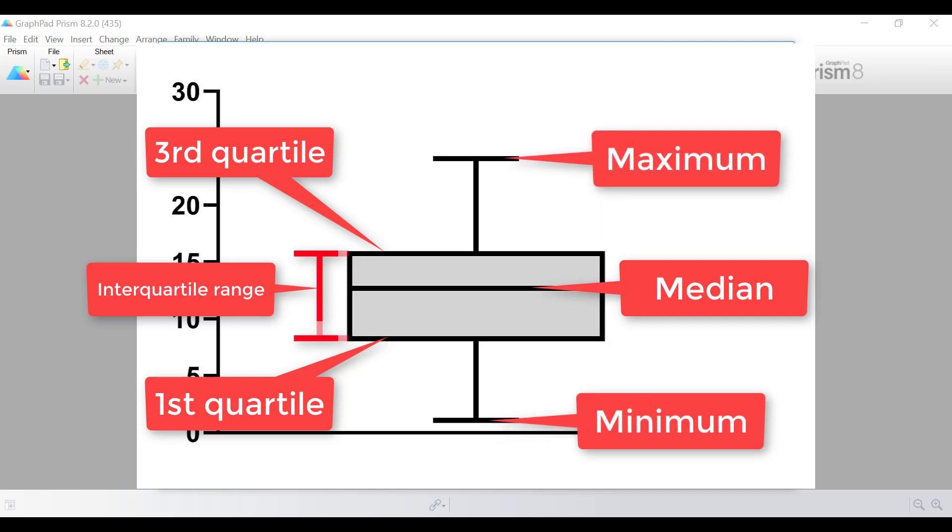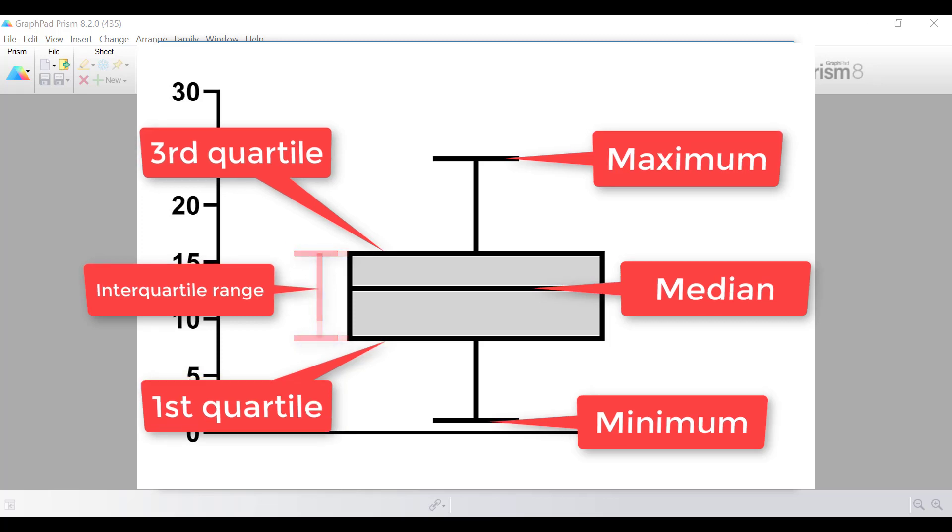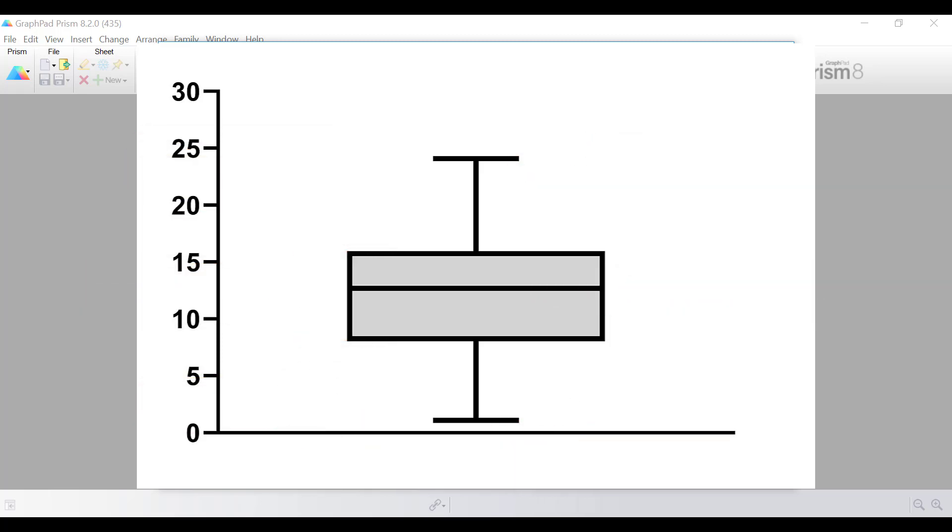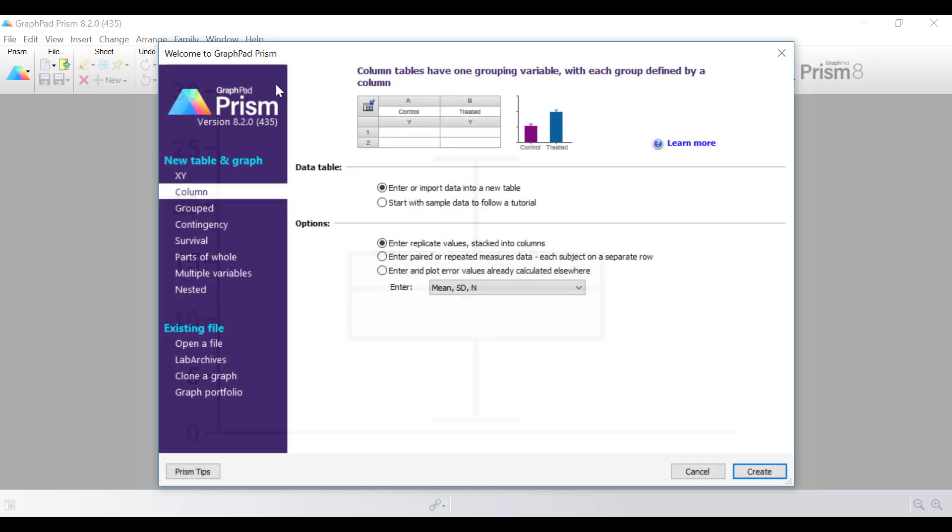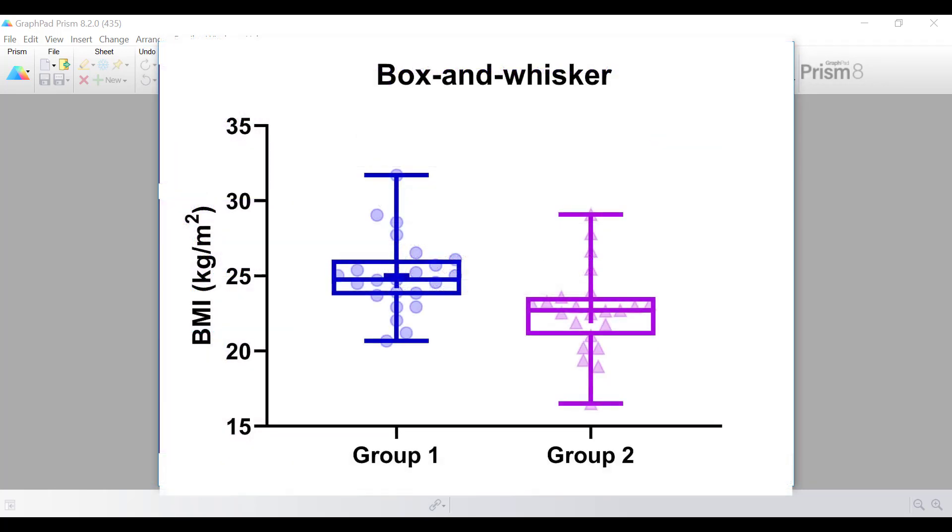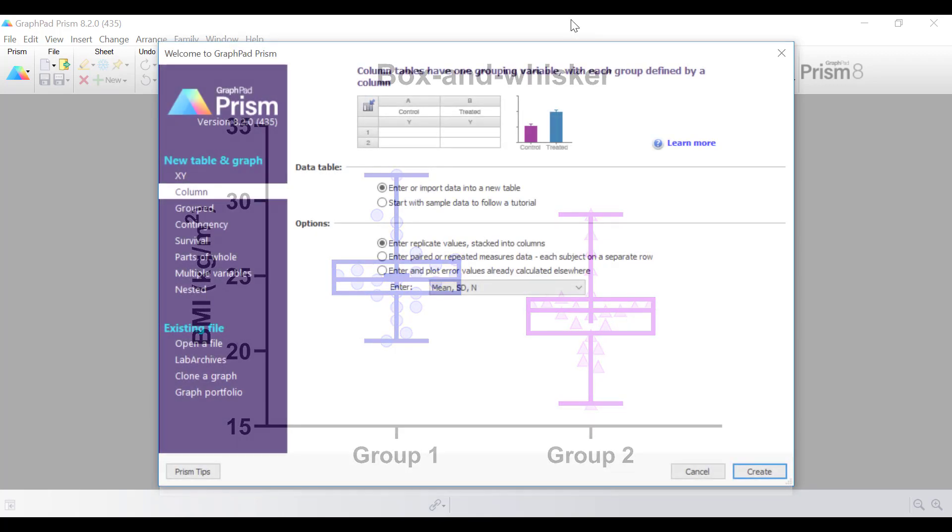By looking at these points of interest on the box and whisker plots, it can tell you a lot about the data, such as whether the data are symmetrical or skewed, and if so, in what direction. However, box and whisker plots are not as good at representing the distribution of your data set compared to a violin plot. In this video tutorial, I will show you how to create this box and whisker plot. So let's jump into GraphPad and begin the tutorial.